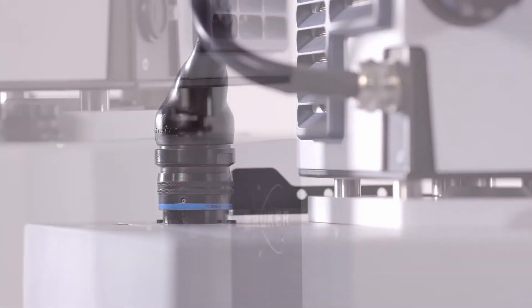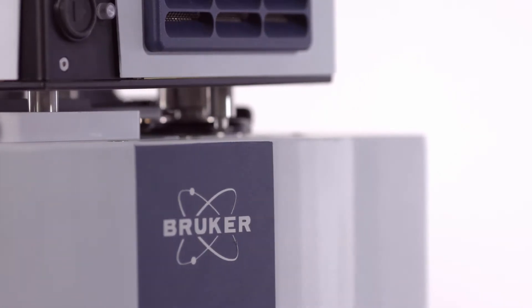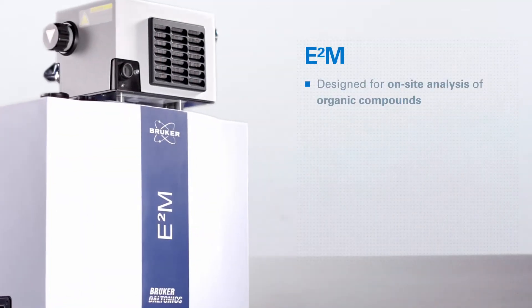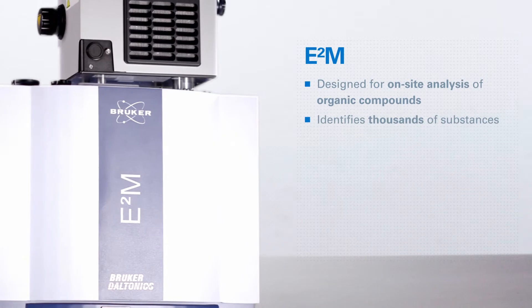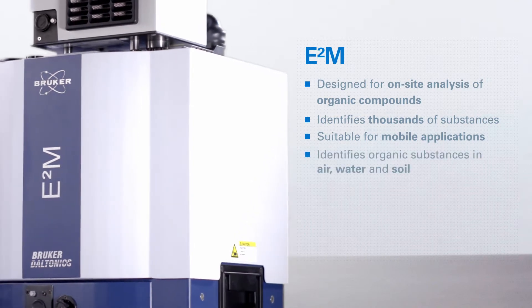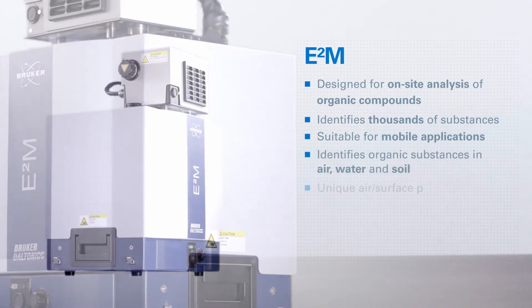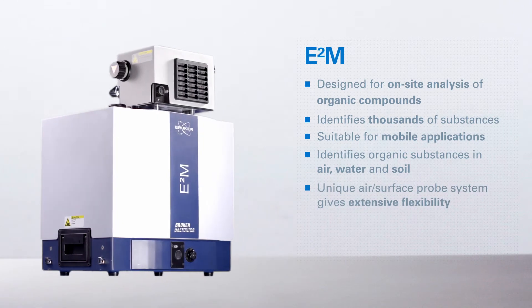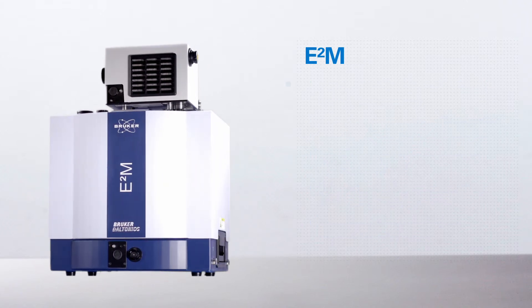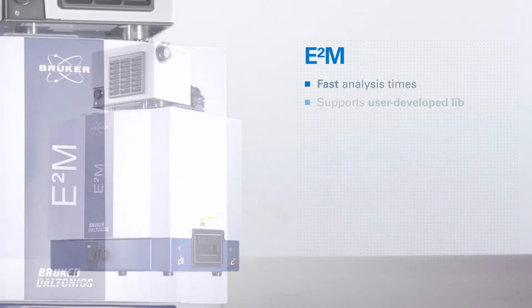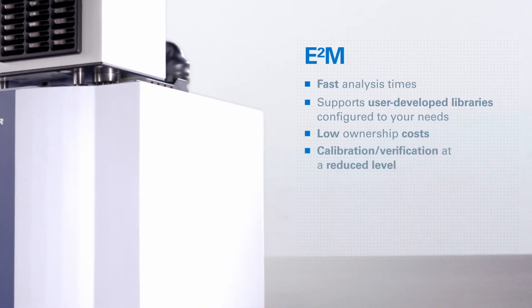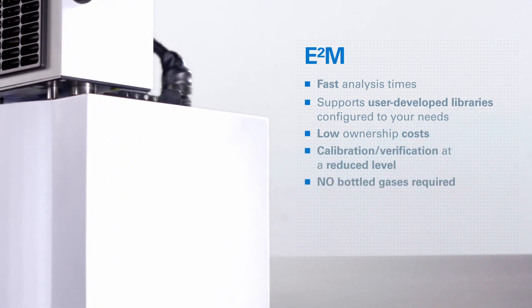The E2M is a mobile, compact, lightweight and rugged GC-MS with the following key features: designed for on-site analysis of organic compounds, identifies thousands of substances, suitable for mobile applications, identifies organic substances in air, water and soil, unique air surface probe system giving extensive flexibility, permanent vacuum system ensures rapid start-up, fast analysis times, supports user-developed libraries configured to your needs, low ownership costs, calibration verification at a reduced level, and no bottled gas required.